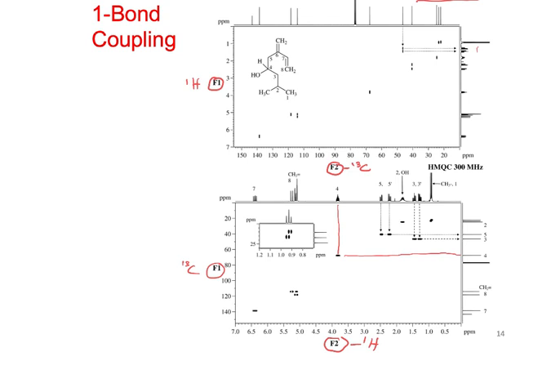Of course, because it's unsymmetrical, there is no diagonal like there is in all those homonuclear experiments. However, we see this slanting up in this direction as well, but that's just because the proton chemical shifts and the C13 chemical shifts follow the same rules, right? The double bond protons and double bond carbons are further downfield, and the aliphatic ones are further upfield. Okay?